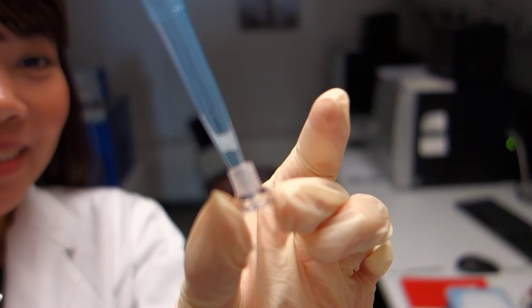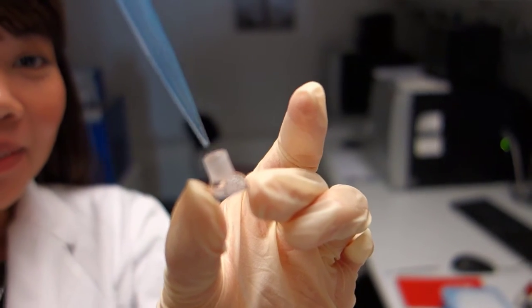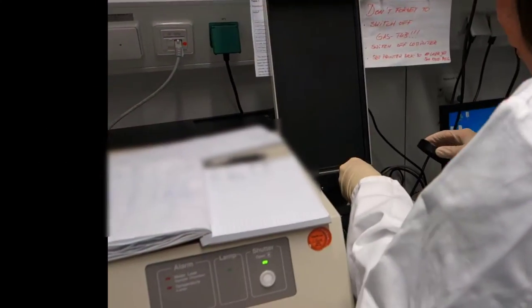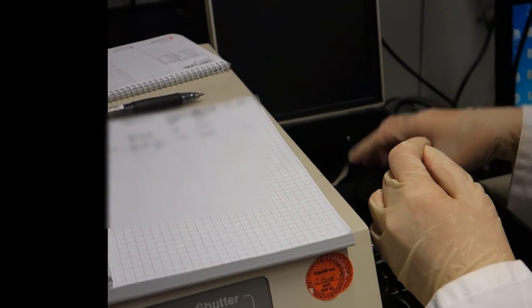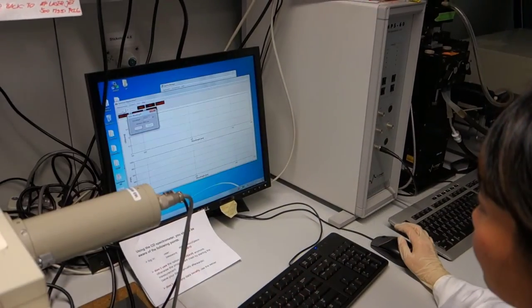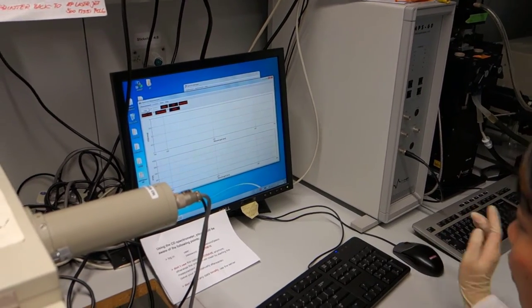After the purification process, we want to know the quality of the protein. Therefore, we estimate the secondary structure and the stability of the proteins by CD spectroscopy. And once we have the proteins ready, we use the pipetting robot Honeybee to set up the protein for crystallization.